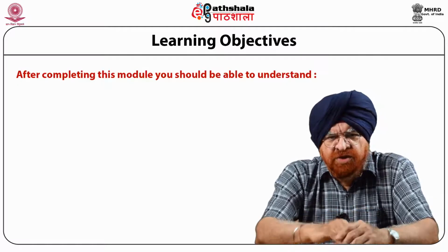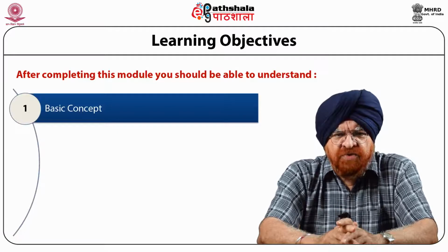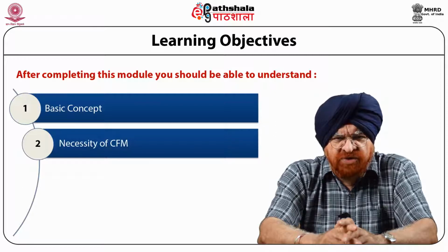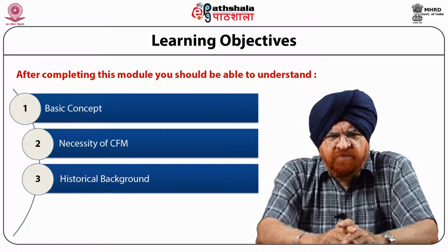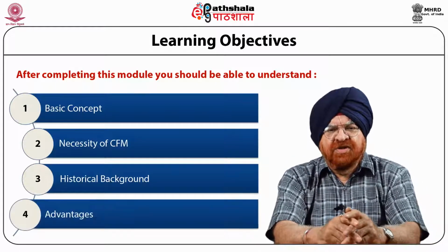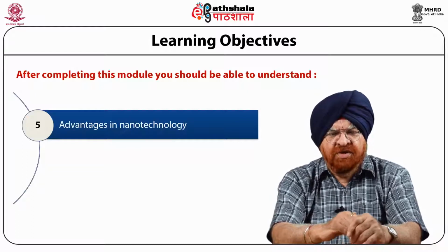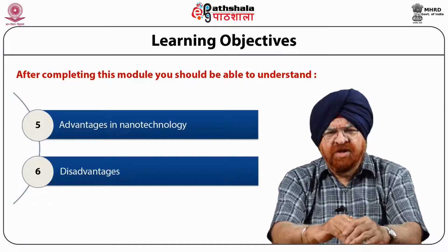After going through this module, you should be able to understand the basic concept of CFM, the necessity of CFM, that is, why was this required, what is the historical background of this, what are the advantages of this, and what are the prime uses of this in nanotechnology, and finally the limitations or disadvantages, as we call these.